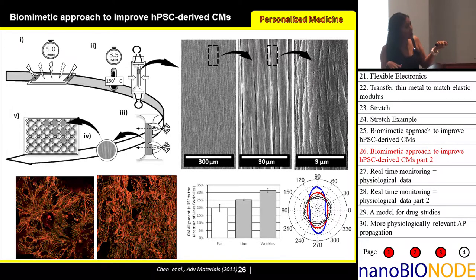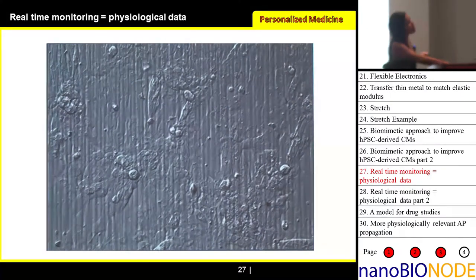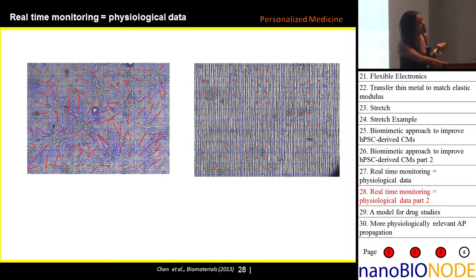And you can create these nanogrooves, and we could put down our cells, our cardiomyocytes, onto these nanogrooves. And we can watch them, and we could see if they mature over time to be more mature cardiomyocytes. So the idea is to treat them like mature heart tissue and see if they actually act more like mature heart tissue. And so you can see them beating here. And we were growing them, and we were watching them beat, and we were taking different measurements, optical flow measurements. And then we realized that we can actually get a lot of information out of these optical flow measurements.